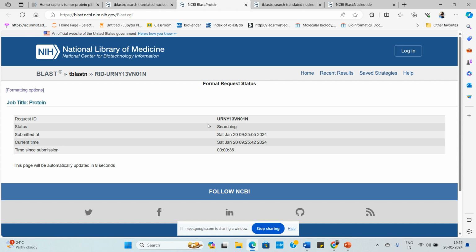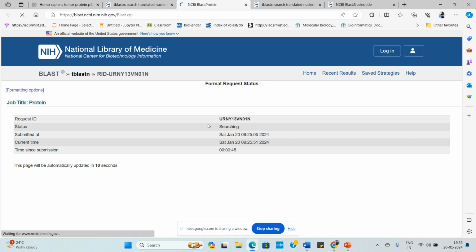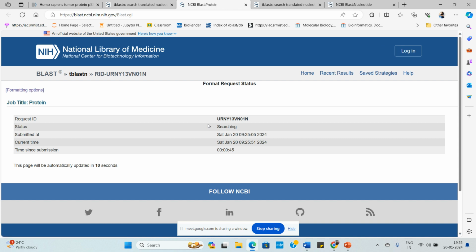When we go through all these programs at once, we have so much confusion about where to use blastx, where to use tblastx, where to use tblastn and so on. But when we are constantly analyzing the output, it will be very easy. Under which condition we have to go for tblastx, under which research application we have to go for tblastn, we can understand where to use what kind of program. But before that, we have to understand how it is working.